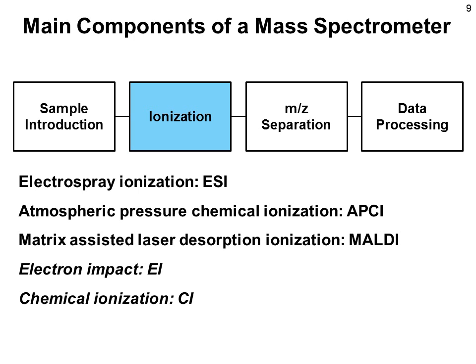Chemical ionization is a derivative of electron impact. Electrons are then first directed at a chemical molecule like methane. Methane is in turn ionized and then transfers an electron, for example, to the molecule that should be ionized. In that sense, it's a bit comparable to APCI, as this is a kind of indirect ionization method. It's more soft than electron impact. In electron impact, the molecule is usually broken up into fragments, whereas in chemical ionization the molecular ion is usually still present.